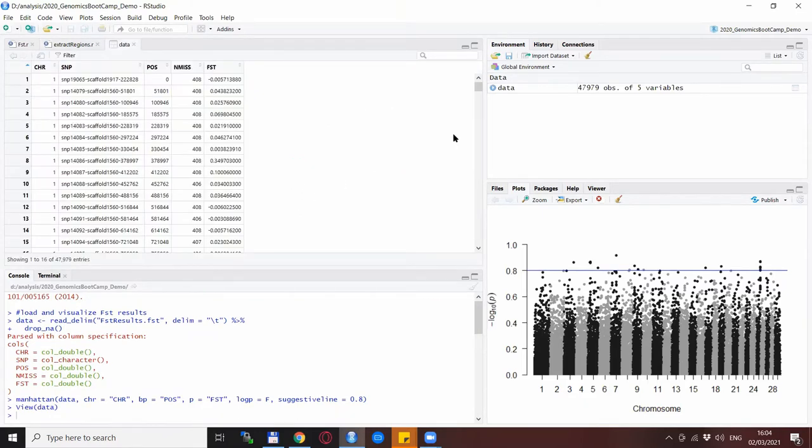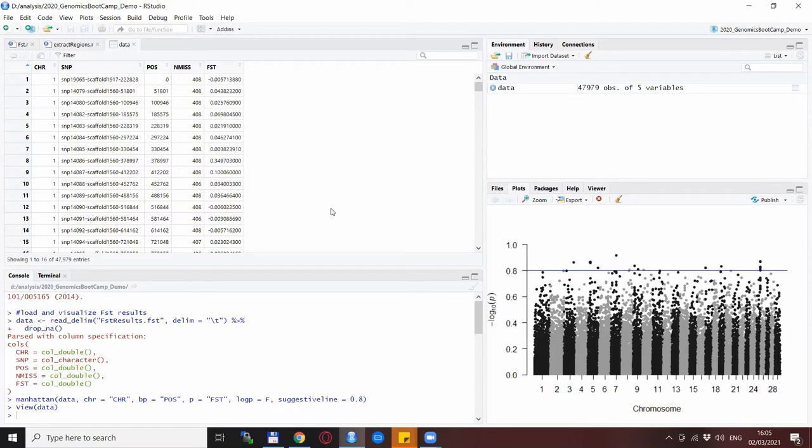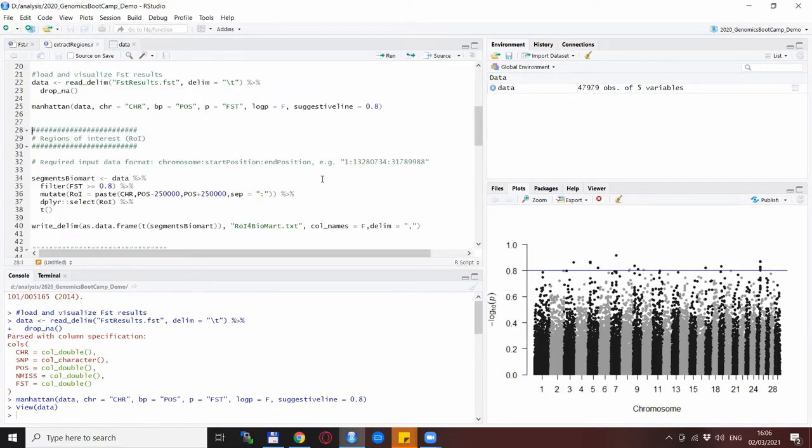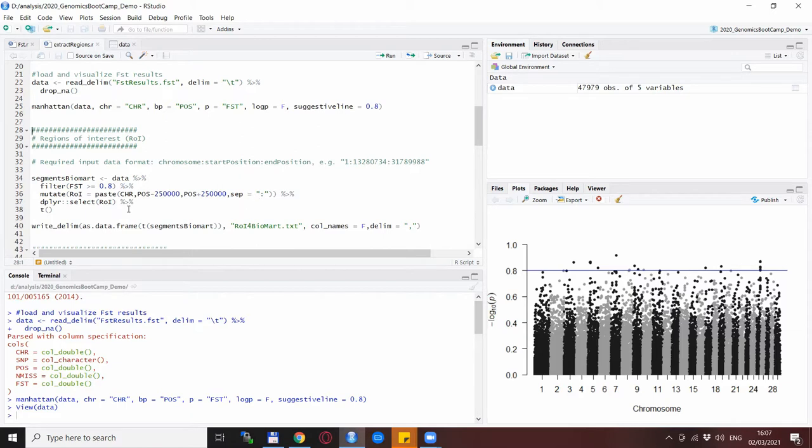This is the data file as we loaded it from the previous results so we have the chromosome but we don't have the first position and the last position for the segment we want to explore. So instead what we are doing is taking the position of the SNP which has the FST higher than 0.8 and for this region around the interesting SNPs I decided to go for plus minus 250 kilobases. So this is in bases, we need to specify it in the bases so that is 250,000 minus from the position and plus 250,000 to the position of the SNP of interest separated by colons and keeping just this one line as the future input for the Biomart software.